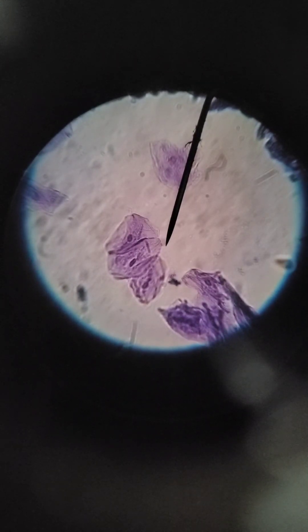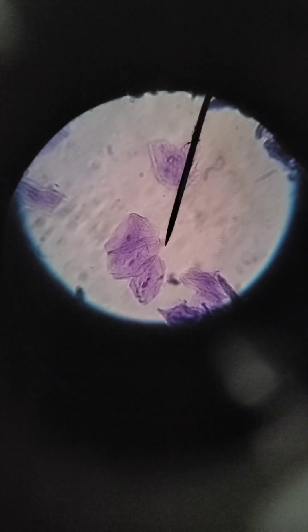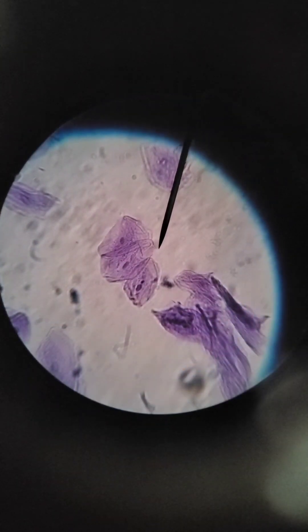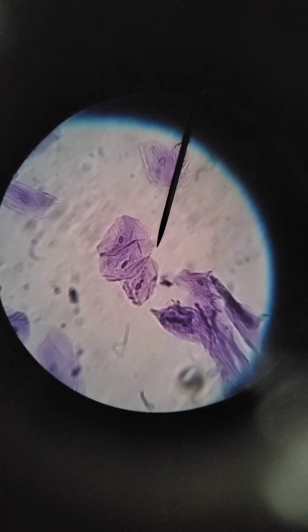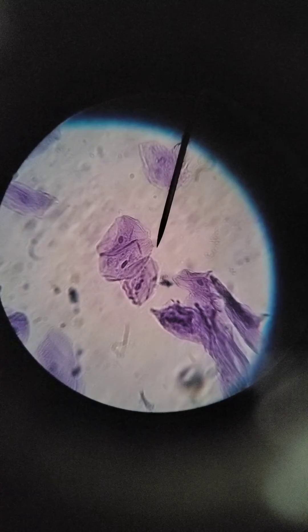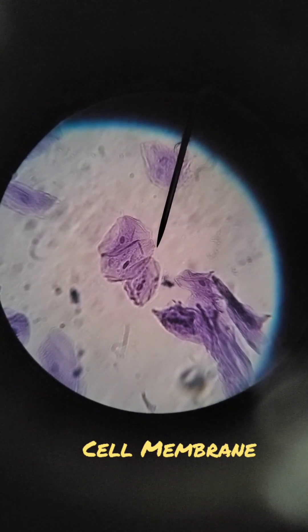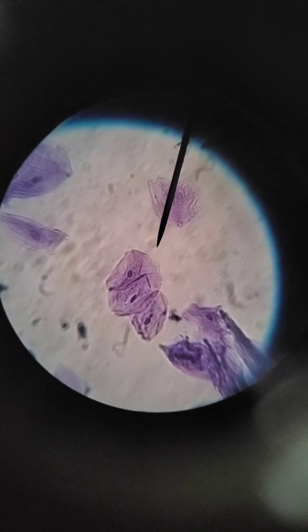There we go — there's three of them right there, side by side. This is on high power. We're going to turn our fine adjustment and use the mechanical stage. We can see the cell membrane on the outside, and we have three cells in a row. You got one, two, three — and each one has a dark nucleus in the middle of it.